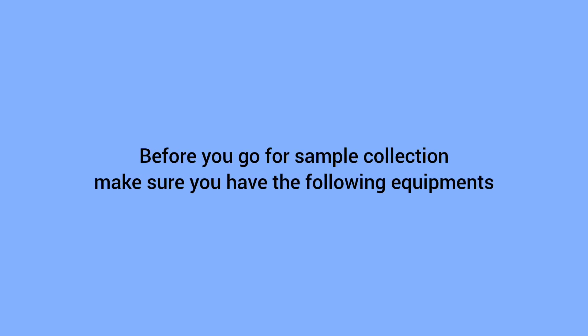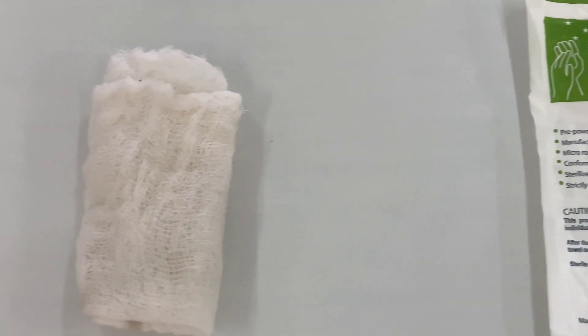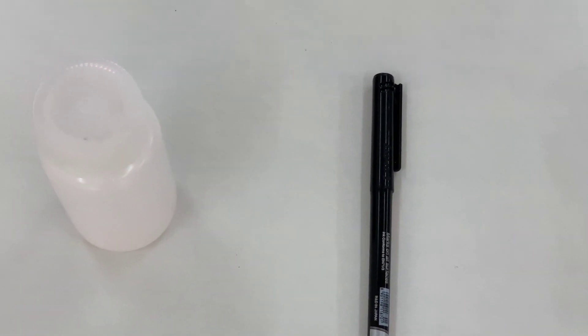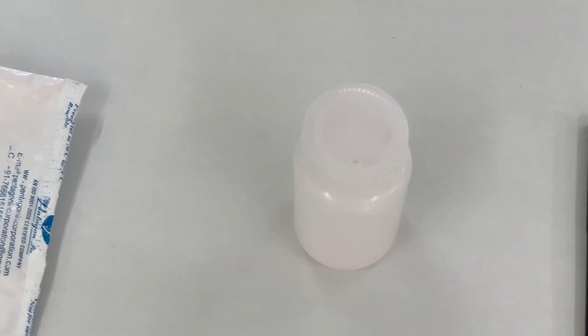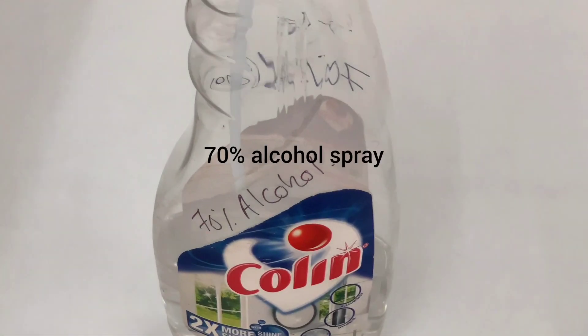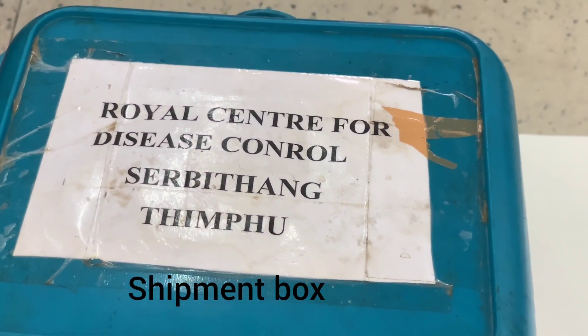Before you go for sample collection, make sure you have the following equipment: gloves, clean gauze piece, sterile wide-mouth non-leaky container and OHP marker, ice packs, 70% alcohol spray, and a shipment box.